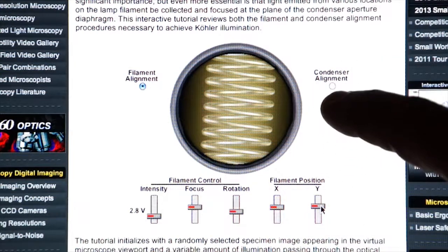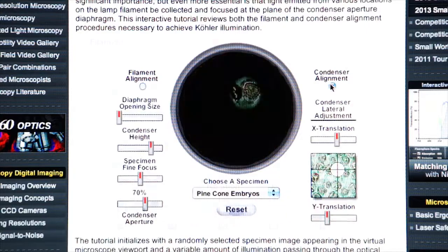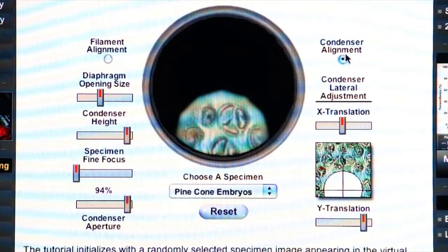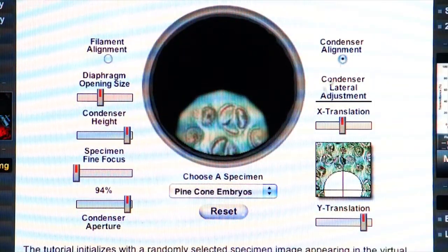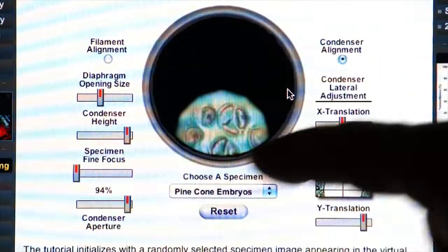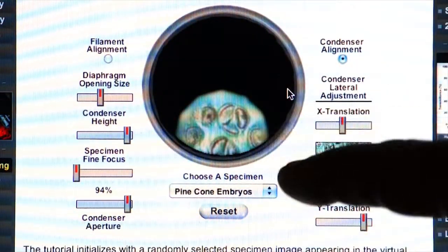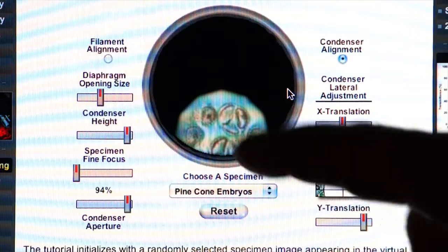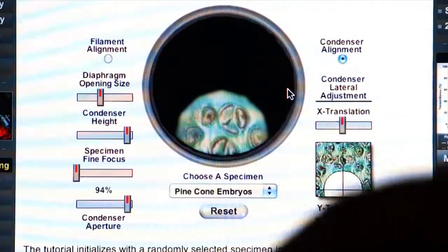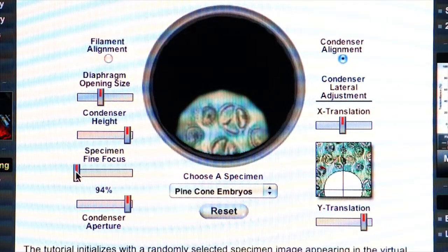Now let's discuss the condenser alignment, because this is how you actually do Köhler illumination. To do that we click on this condenser alignment tutorial. The first thing to do when you're doing Köhler illumination is to use the 10x objective and to get your specimen finely focused.